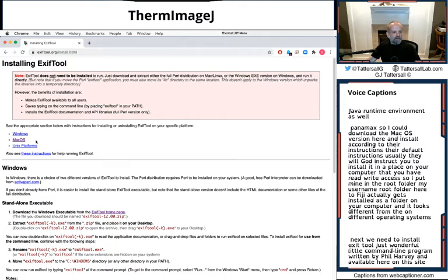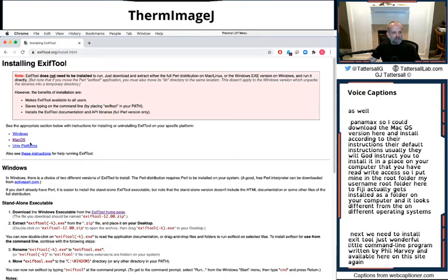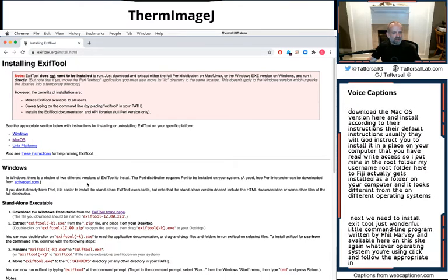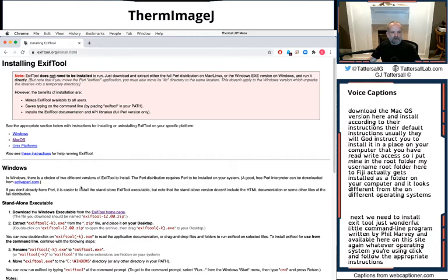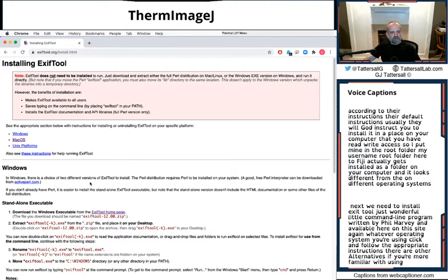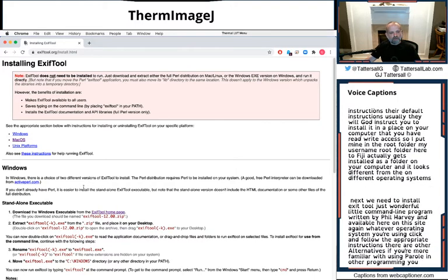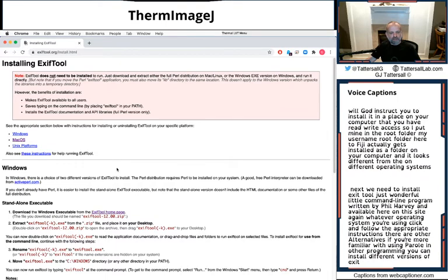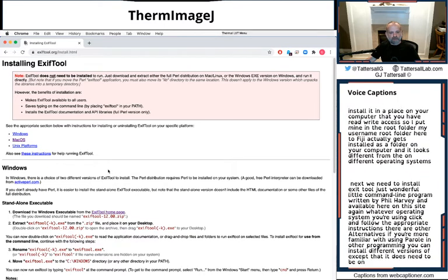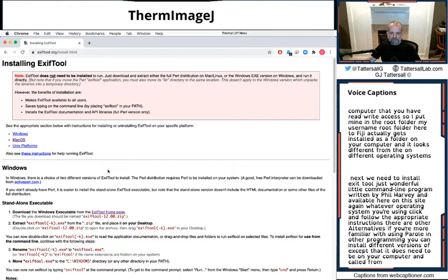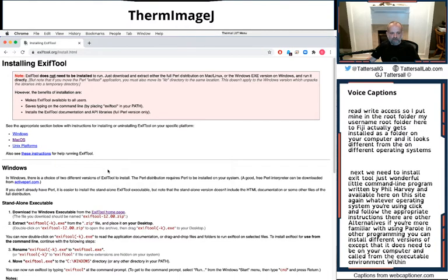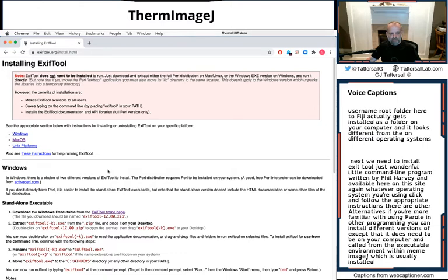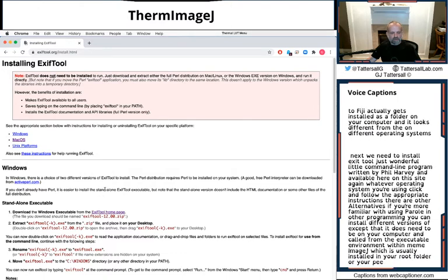Again, whatever operating system you're using, click and follow the appropriate instructions. There are other alternatives. If you're more familiar with using Perl and other programming, you can install different versions of EXIFTOOL, but it does need to be on your computer and called from the executable environment within ImageJ, which is usually installed in your root folder or your path folder for your particular operating system.